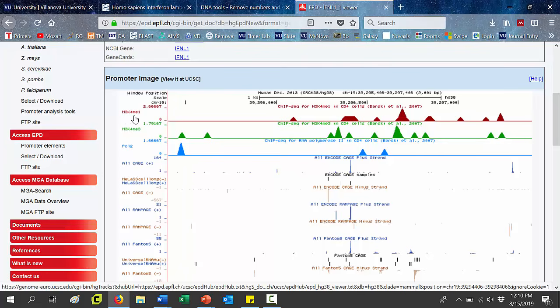And this H3K4me1, likewise H3K4me3, which is just the trimethylated version of this modification, both of these marks are commonly associated with histones that are in promoters. So if we see a lot of peaks here, that means that we probably have a promoter region. This is an area of active transcription, so it's good to see these peaks there. And the position of the peaks tells you where those histones would be. Okay, so this looks good.